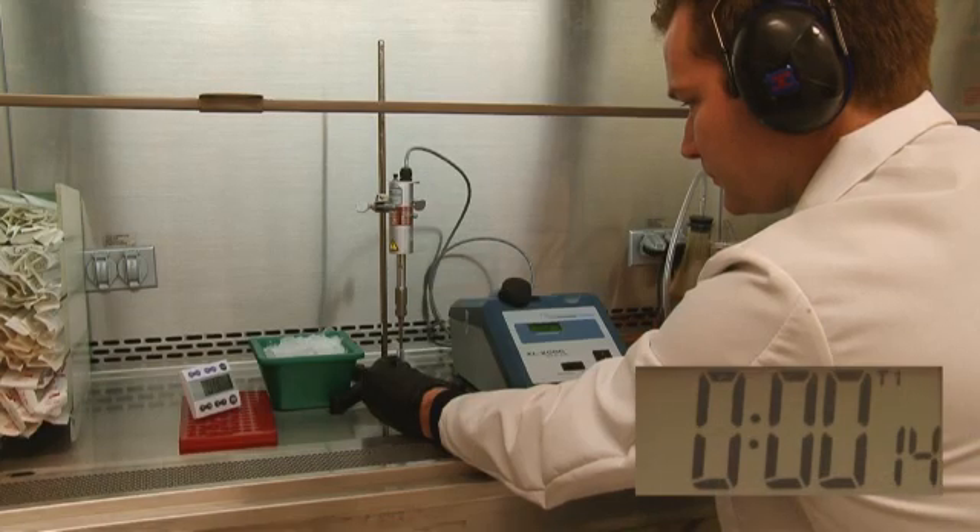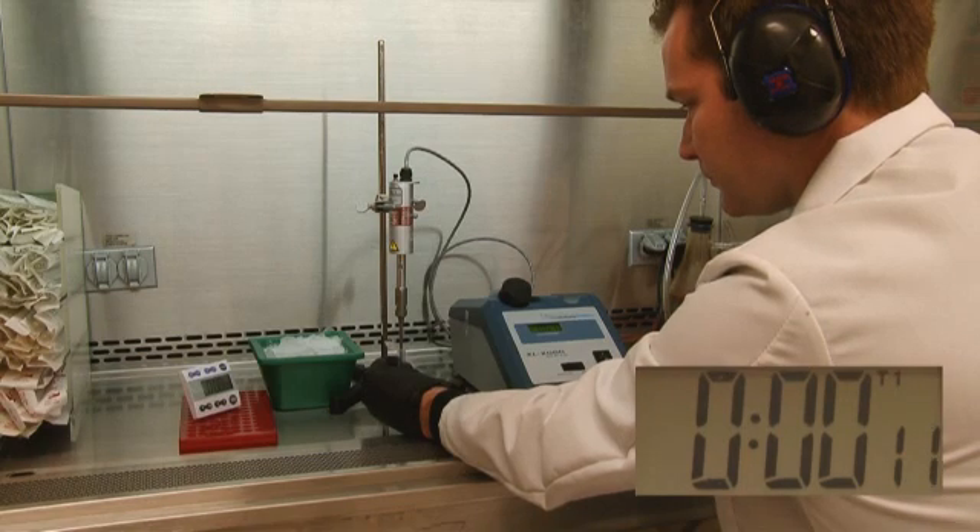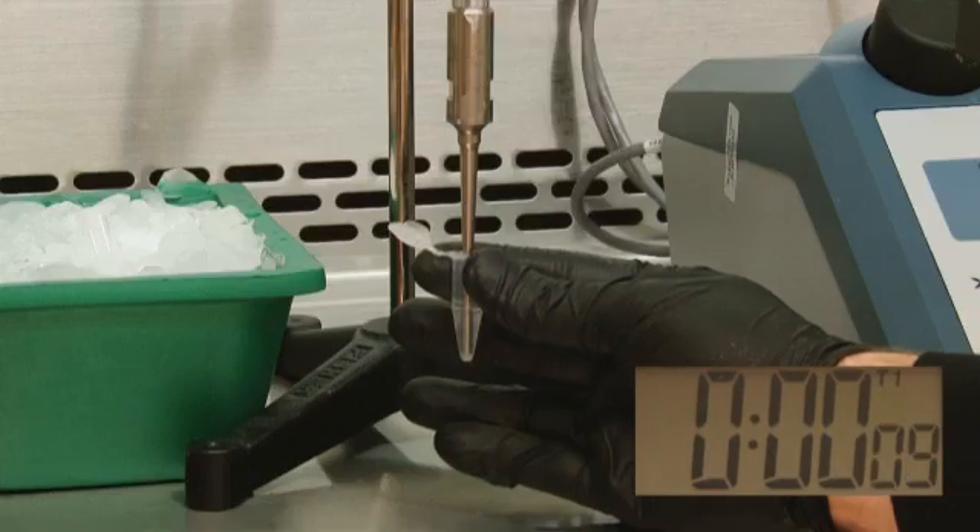This will prevent foaming of the sample, as foaming decreases the efficiency of the sonication procedure. In addition, perform a time course of multiple short sonications instead of fewer, longer treatments. This minimizes heat buildup and unwanted denaturing of your chromatin.